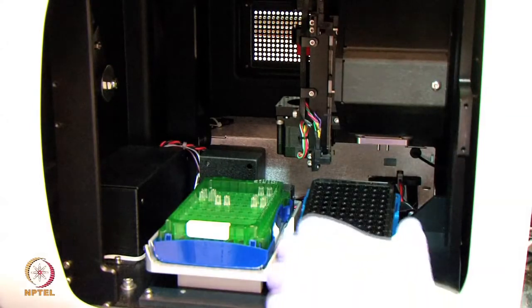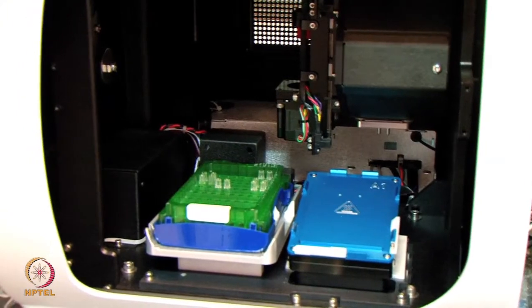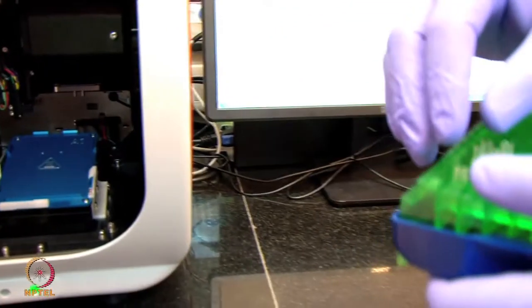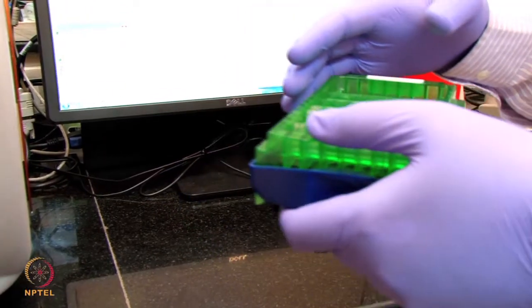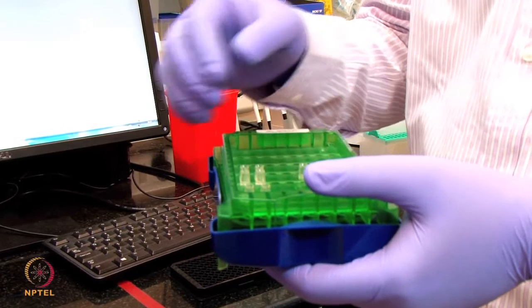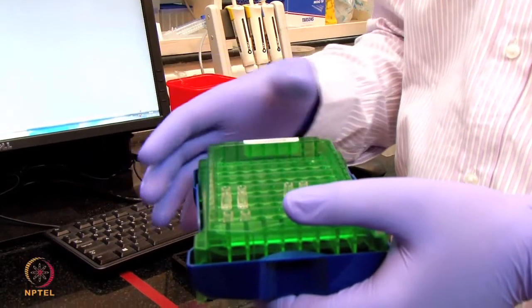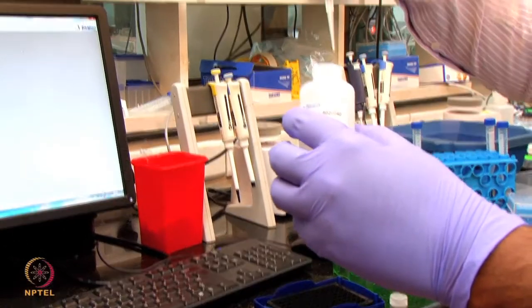Now I am going to take back this sample plate and also the sensor tray. This sensor, which is hydrated in the PBS buffer, and also our biotinylated antibody, is in the PBS buffer. Now I am going to equilibrate these sensors with the PBST buffer, the PBS buffer having Tween in it. We call this PBST buffer the sample diluent buffer.